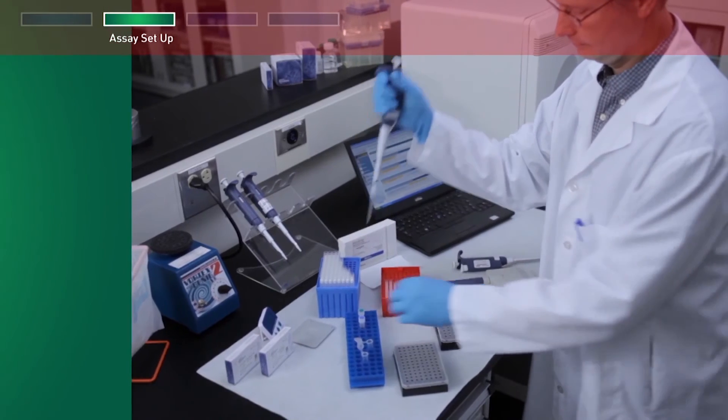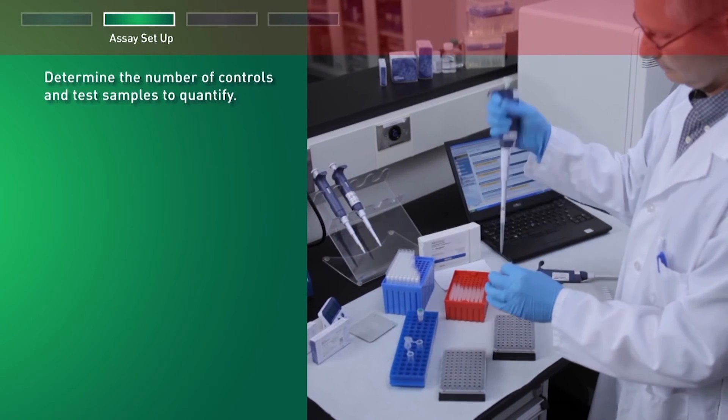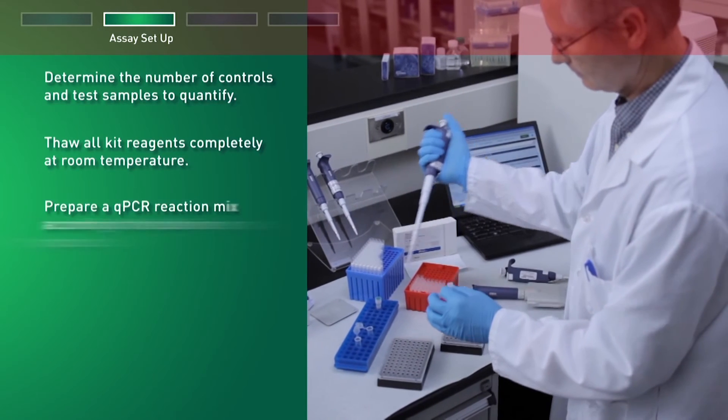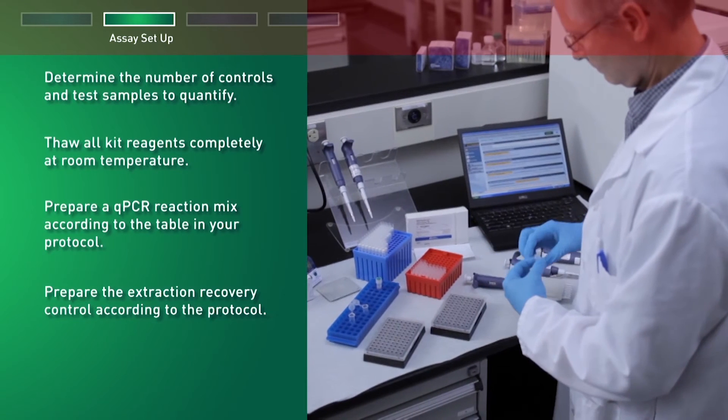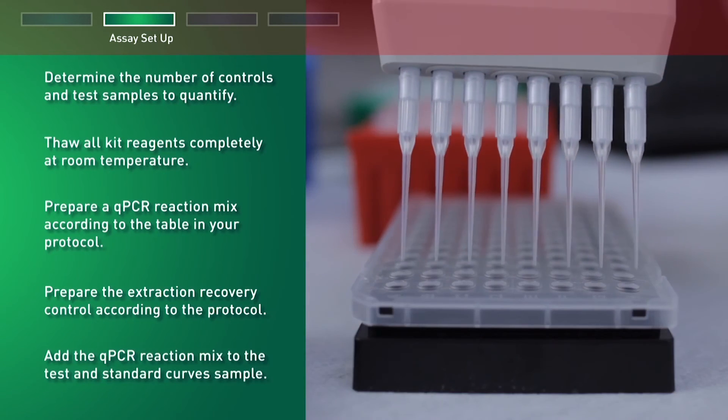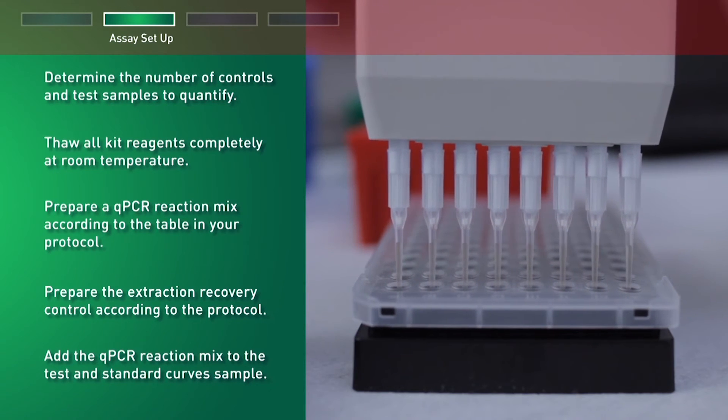First, determine the number of controls and test samples to quantify, then thaw all kit reagents completely at room temperature. Prepare a qPCR reaction mix according to the table in your protocol. Prepare the extraction recovery control according to the protocol, then add the qPCR reaction mix to the test and standard curve samples.